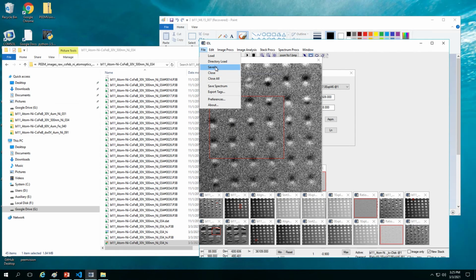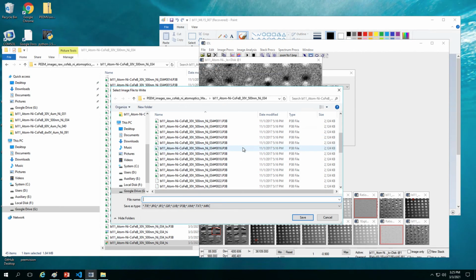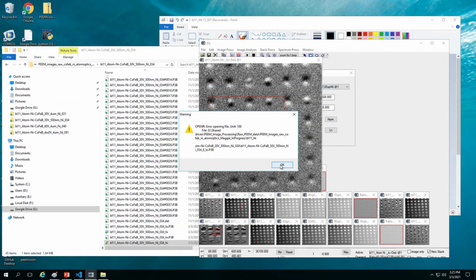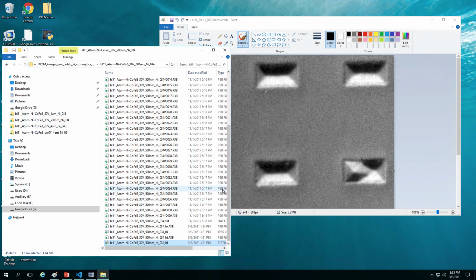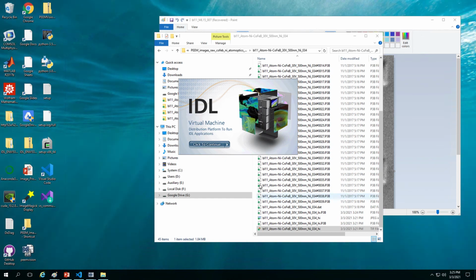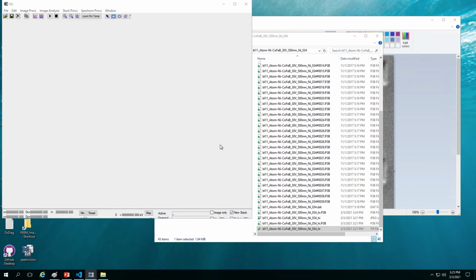Similarly, we save as, this time it's low and Tiff. Low Tiff. Oh, I think it crashed. Wow, it's fine. Yeah, so the idea is like this, okay? Let me know if you have any questions.